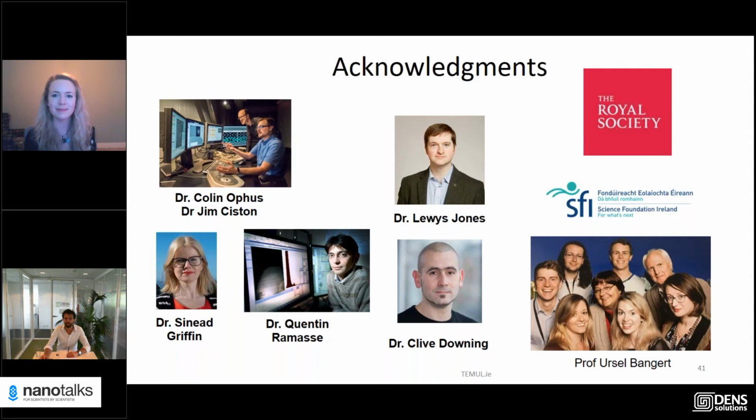I see that we have some questions coming in. The first one is from Yui Ding from TU Darmstadt. The question is, do you have any experience of in-situ biasing of ferroelectric ceramic materials?